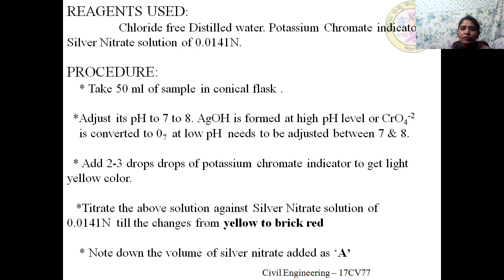We take distilled water which is chloride free and determine the titrant used, and that is always subtracted from the titrant value of the first titration. Why do we do this indicator blank correction? First of all, to have better accuracy. The titrant is added in excess so that the human eye can witness the color change.